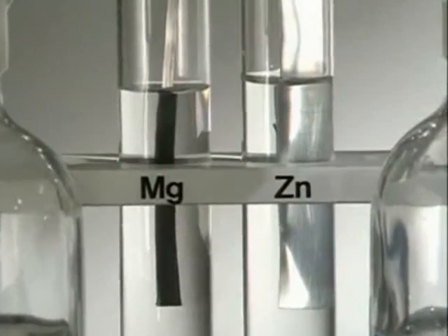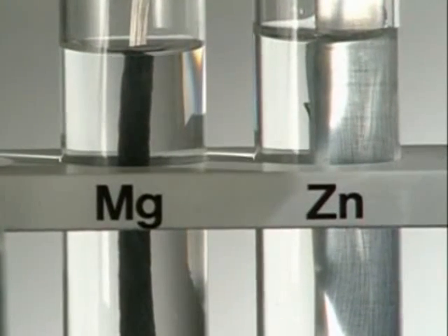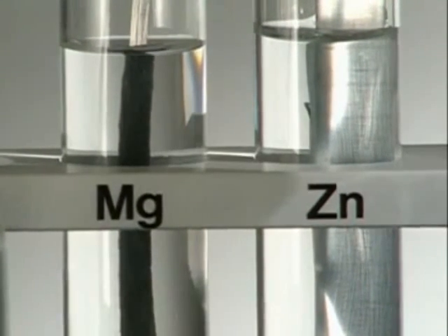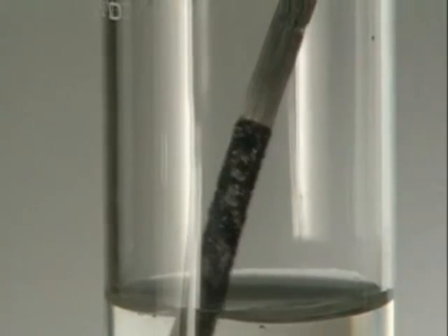Nothing happens to the zinc strip on the right. But magnesium reacts instantly, displacing the zinc from solution. Magnesium is the winner. It's the most reactive.